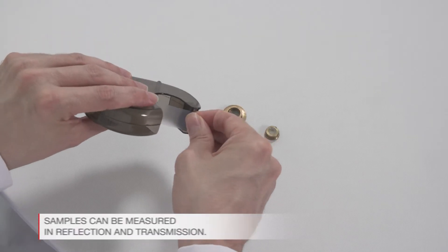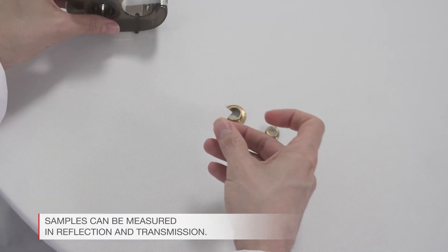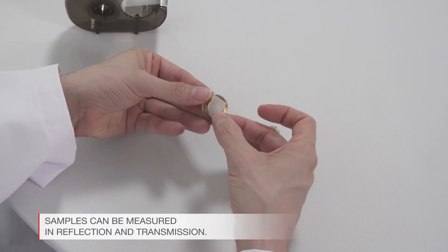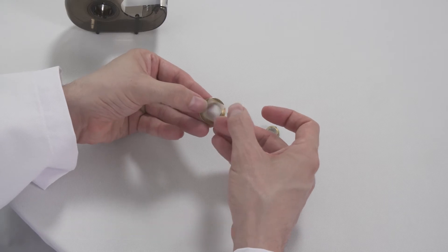Samples can be measured in reflection and transmission. Transmission measurements can reduce preferred orientation effects and produce more accurate peak intensities.